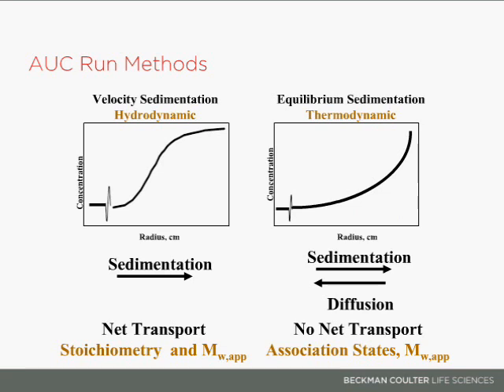for studying nanoparticles. There's also equilibrium sedimentation, and this is used occasionally for protein work. This is more for looking at the association states of protein. Essentially what you're doing is allowing the centrifuge to run until all the particles are in equilibrium, so the buoyancy force, the centrifugal force, and the frictional force have all balanced out. These runs can take up to a week, are very long, and not particularly useful for nanoparticle studies.